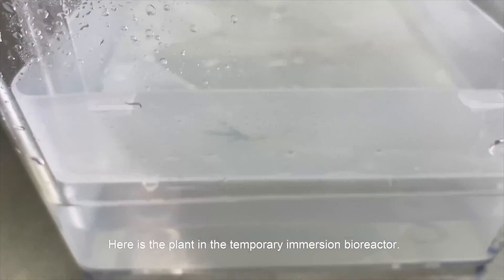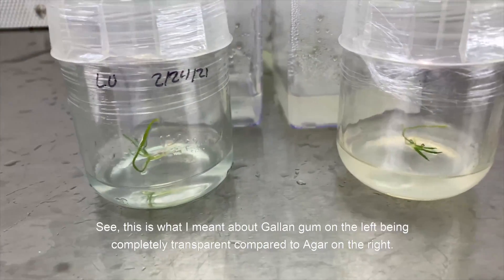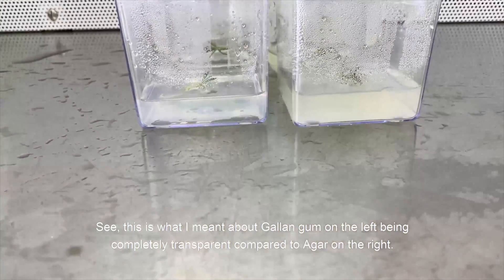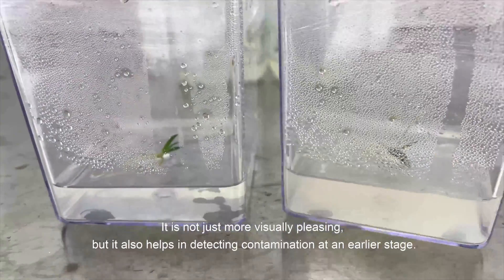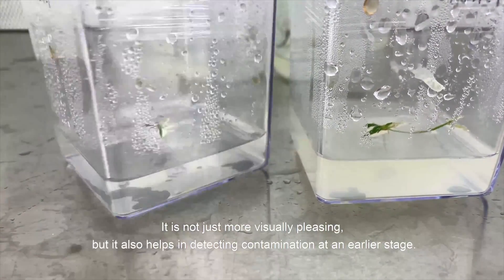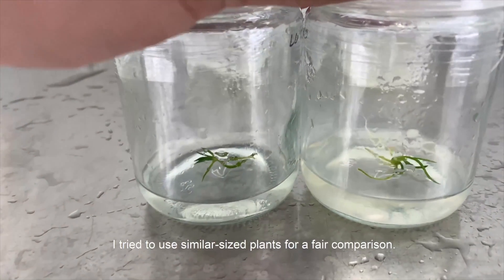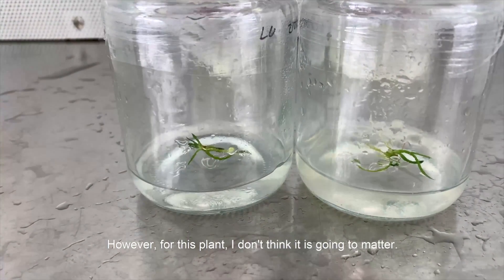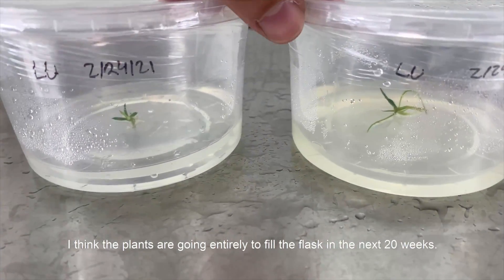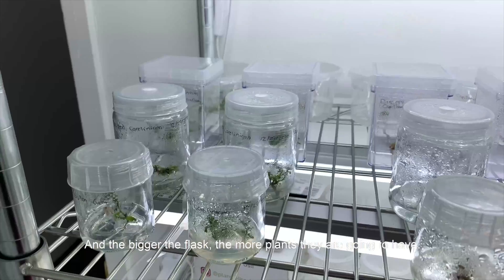Here is the plant in the temporary immersion bioreactor — only one plant, but I know this plant propagates very quickly. This is what I meant about gelangum on the left being completely transparent compared to the agar on the right. It is not just more visually pleasing, but it also helps in detecting contamination at an earlier stage. I tried to use similar size plants for a fair comparison, though for this plant I don't think it's going to matter — I think the plants are going to entirely fill the flasks in the next 20 weeks, and the bigger the flasks, the more plants they're going to have.